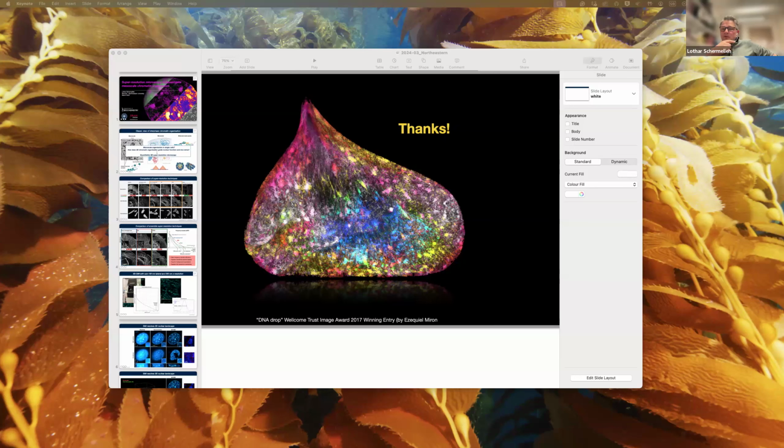Thank you, great talk. Can you comment on the dynamics of chromosomes? Does the surface and internal chromosome domain rapidly exchange? Very good question, because that's something that we are just investigating using single molecule tracking. So essentially, what our findings in fixed cells imply is that there isn't a massive exchange of nucleosomes from the outside to the inside and back.